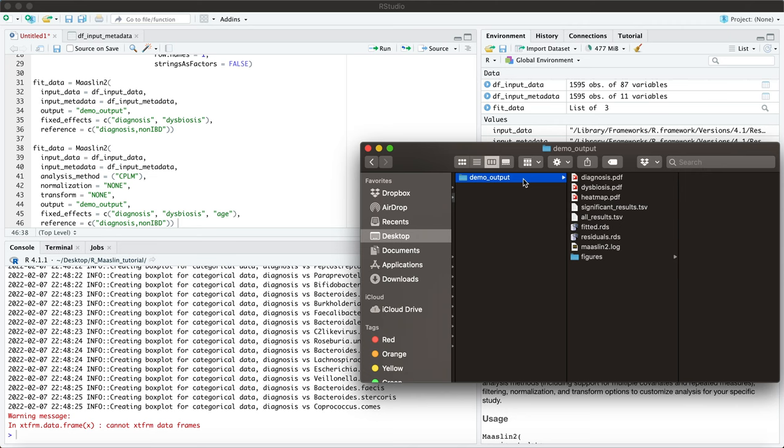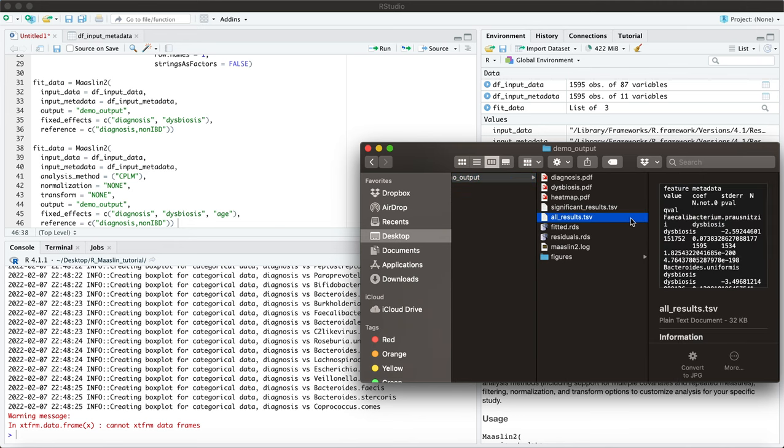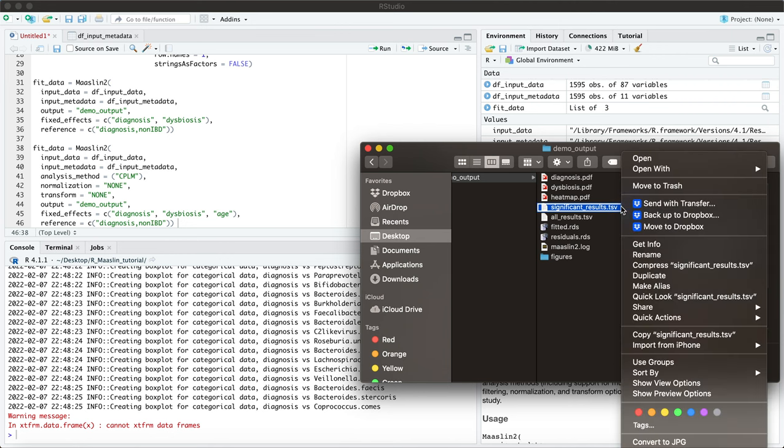Okay so let's briefly take a look at the output files. These are saved in the folder that we created for our new directory and it separates it out by all results or by just the significant results. These are both in TSV format, you can open these in Excel.